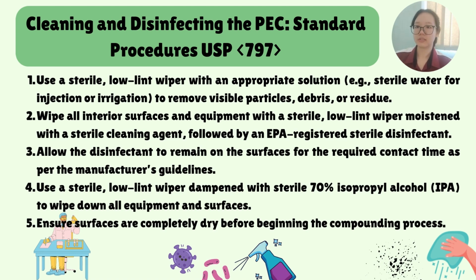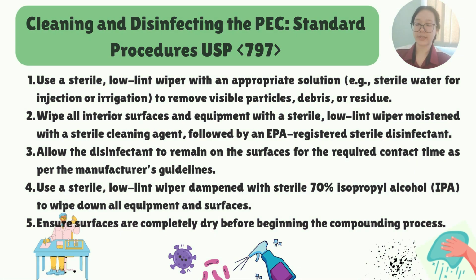It is important to allow the disinfectant to remain on the surfaces for the required contact time, as recommended by the manufacturer, to ensure full effectiveness. Finally, a wipe down is done using sterile 70% isopropyl alcohol to remove any residual disinfectant and provide an added layer of microbial control. Before starting any compounding, we must confirm that all the surfaces are completely dry.